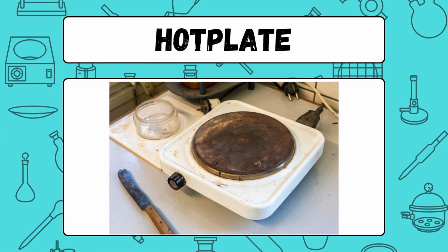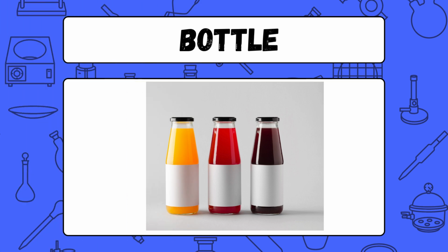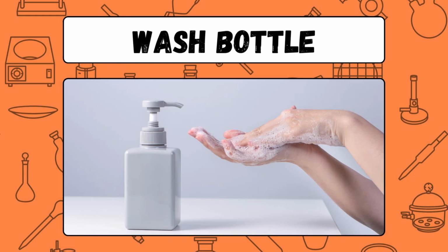Hot plate. A hot plate is a laboratory device used to heat substances in containers, typically with a built-in temperature control. Bottle. A bottle is a container, typically made of glass or plastic, used for storing liquids or chemicals in a laboratory.